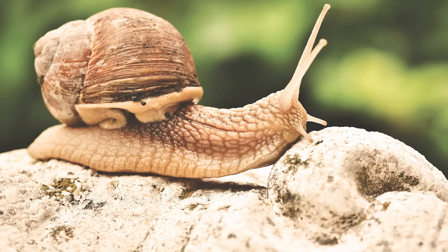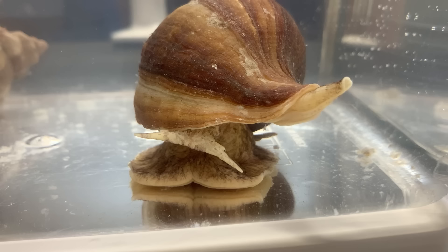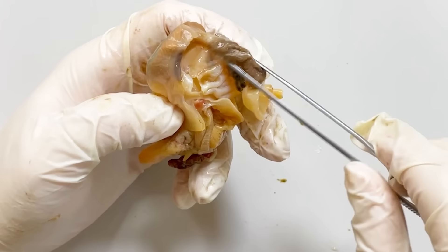Similar to snails, the anus in whelks is also located in the front. This part is the siphon, where the whelk breathes using water that enters through it. Above the siphon, you can find the gills, which aid in respiration and gas exchange.